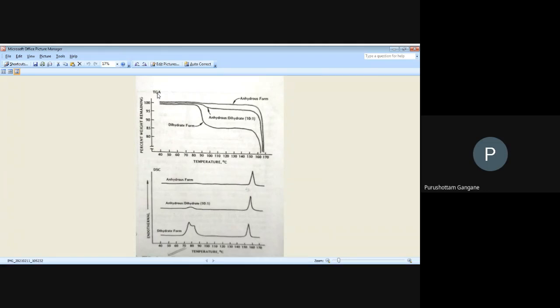The principle of gravimetric is somewhat different. It measures the changes in the sample weight. In thermogravimetric analysis, it measures the changes in the sample weight as a function of time or temperature. When there is gravimetry, there is a relationship with the weight.